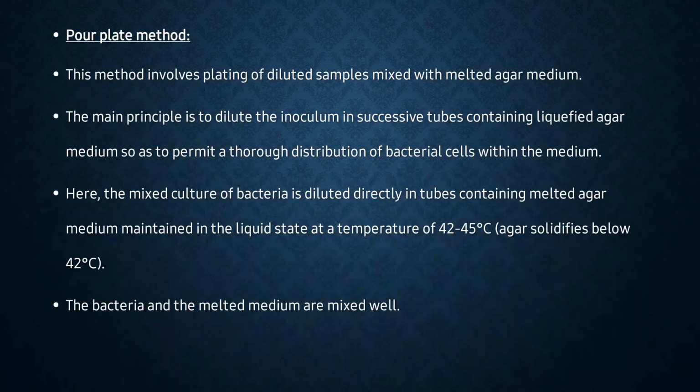Next is pour plate method. This method involves plating of diluted samples mixed with melted agar medium. The main principle is to dilute the inoculum in successive tubes containing liquefied agar medium so as to permit a thorough distribution of bacterial cells within the medium.